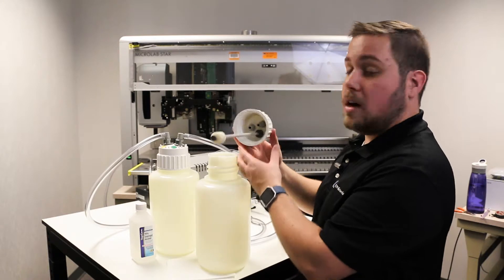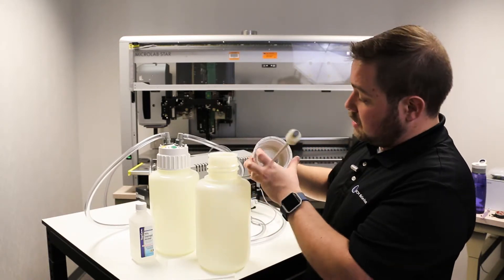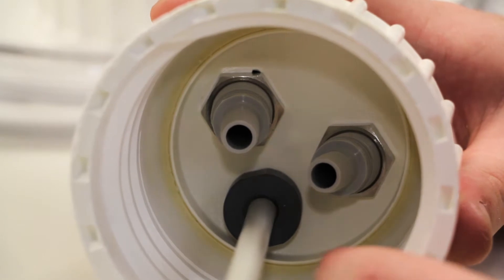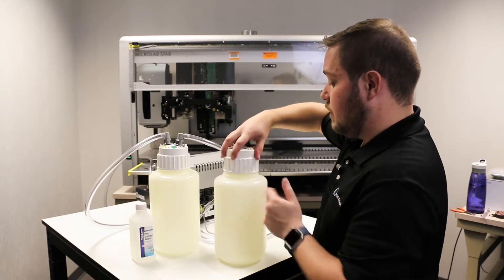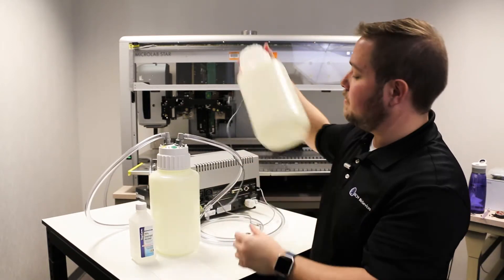Just as with the primary bottle, you'll want to check the female fittings and the male fittings, making sure that they're nice and tight. Check the cap's o-ring, make sure it's clean, and check the bottle's threads to make sure that they're clear. Tightly assemble the cap onto the bottle.